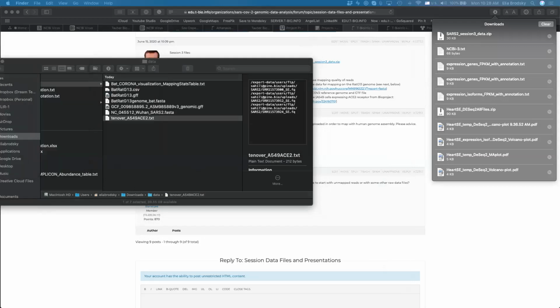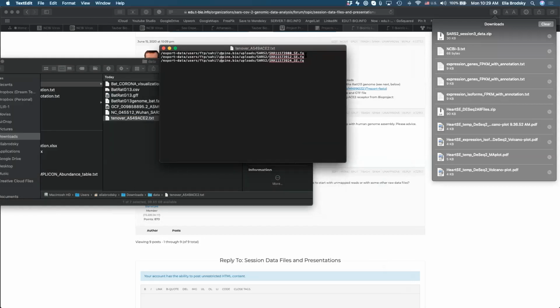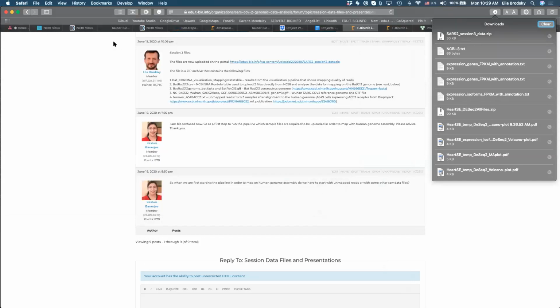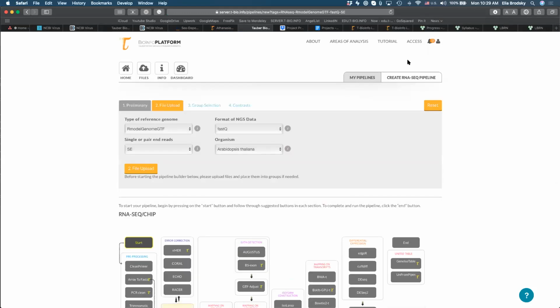shared, okay, which screen am I sharing here? Okay, yes, I am sharing this screen, great. So this is where I took one of these samples, right? You just copy and paste it, or you can actually upload it as bulk upload. Okay, so let me show you that again, and I'll explain the difference between bowtie 2G and bowtie 2T.